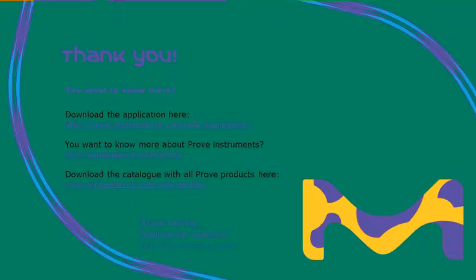Well, thanks, Carolyn, and thank you very much, Bruce, for those excellent presentations. We now have time for a few questions, and as a reminder, if you have any questions, now would be a very good time to send them in. To do that, simply click on the black Ask a Question button below the play window, type in your comments, and click OK. So, Bruce, the first question we have is, in the presentation you talk about measuring silicate in boiler and process water. Can this test be used for other applications where I'm measuring silicate, for example, workplace monitoring for respirable crystalline silica?